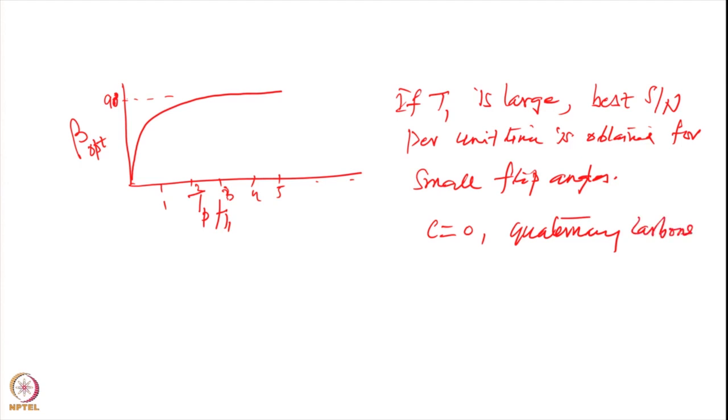They have very long relaxation times. So in such a situation, what should one do? We use a very small flip angle. One more point we will have to consider here is the digital filtration, the data processing aspects.